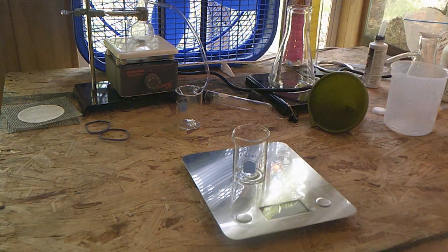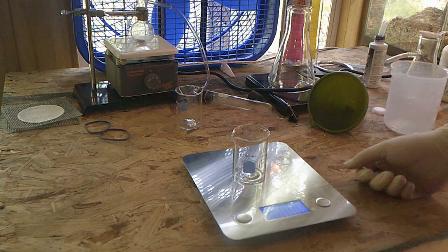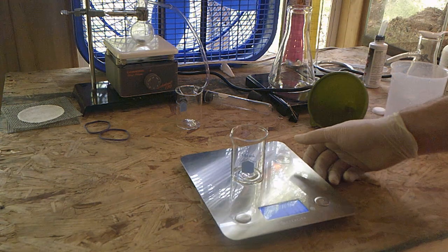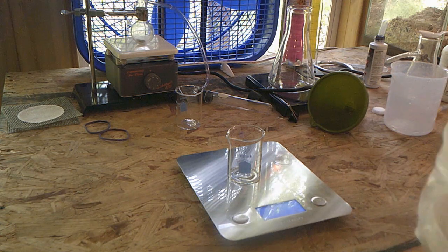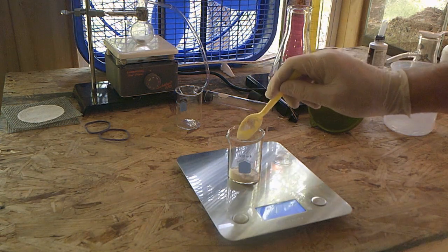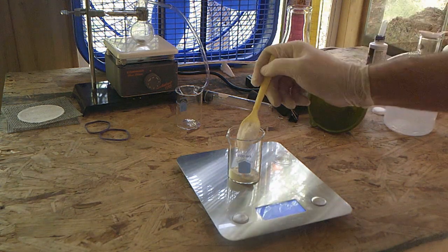The first compound we're going to use is just dextrose or corn sugar. And let's go and tare that off at 0. We're going to need a little bit more corn sugar than we're going to use potassium hydroxide. So we're going to start off with about 8 grams of corn sugar. This will look by volume like a lot more dextrose than we're going to have for the other compound, and that's actually due to density.